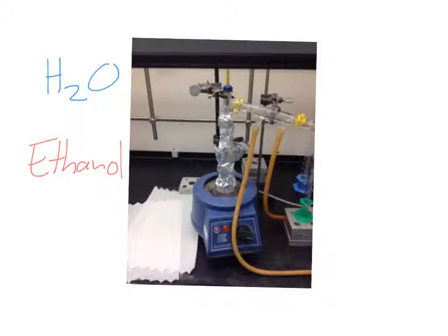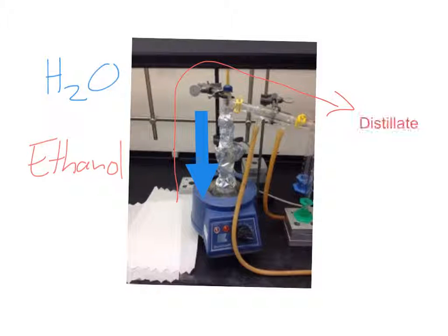The vapor will get condensed and drop back into the solution, while the ethanol will evaporate out of solution and become the distillate. This is how we can separate ethanol from water.